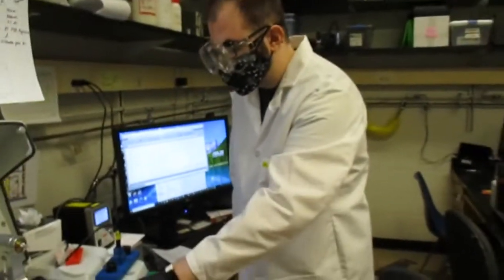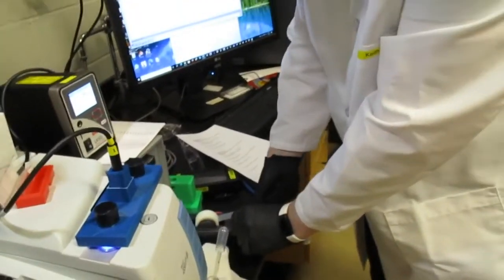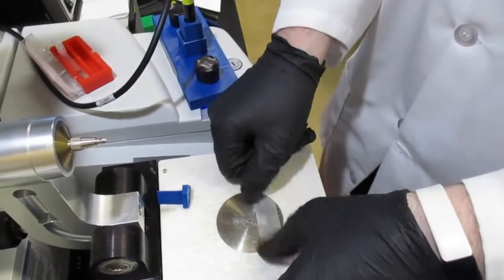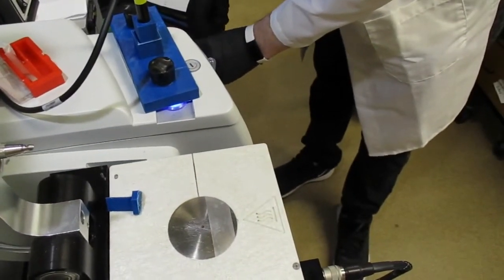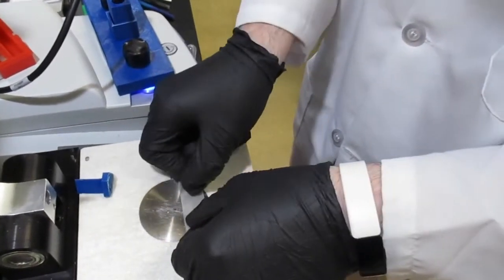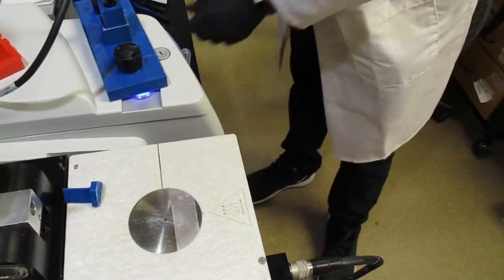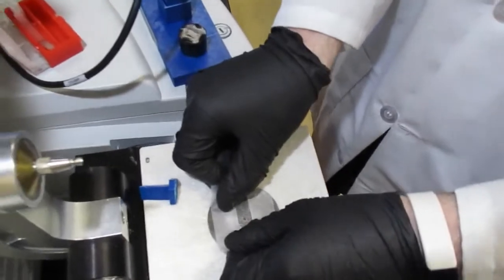So to put your sample on the ATR stage, first what you must do, especially if you're doing a photopolymerization experiment, is to set the thickness. And we can set the thickness by using tape. And the minimum amount of tape you can put is 2, because otherwise the sample won't be on top of the diamond plate sensor.